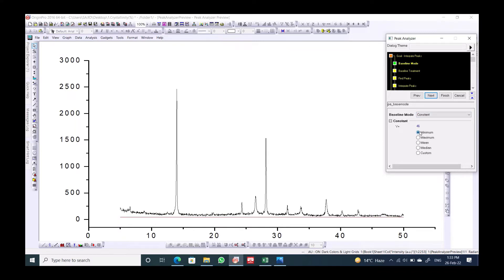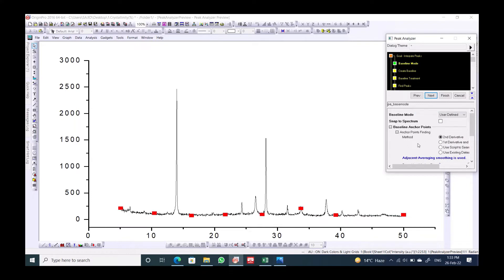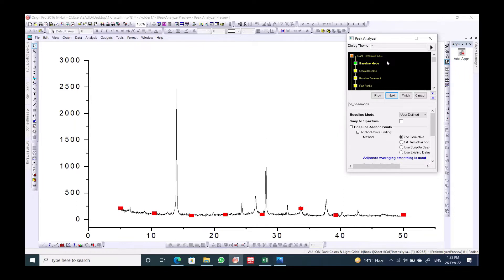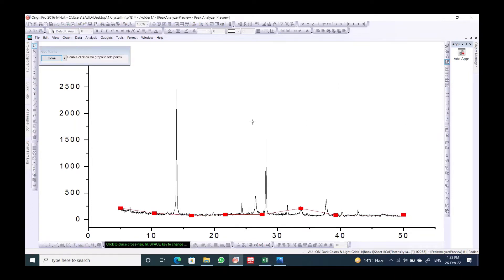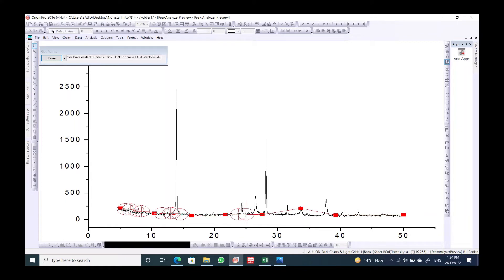Next, we have to define the baseline. If the baseline looks good you can keep it, but if you have a very low baseline you can use the User Defined Baseline option. After selecting that, click Next and add some baseline points — for example, add points like this and double-click each parameter.